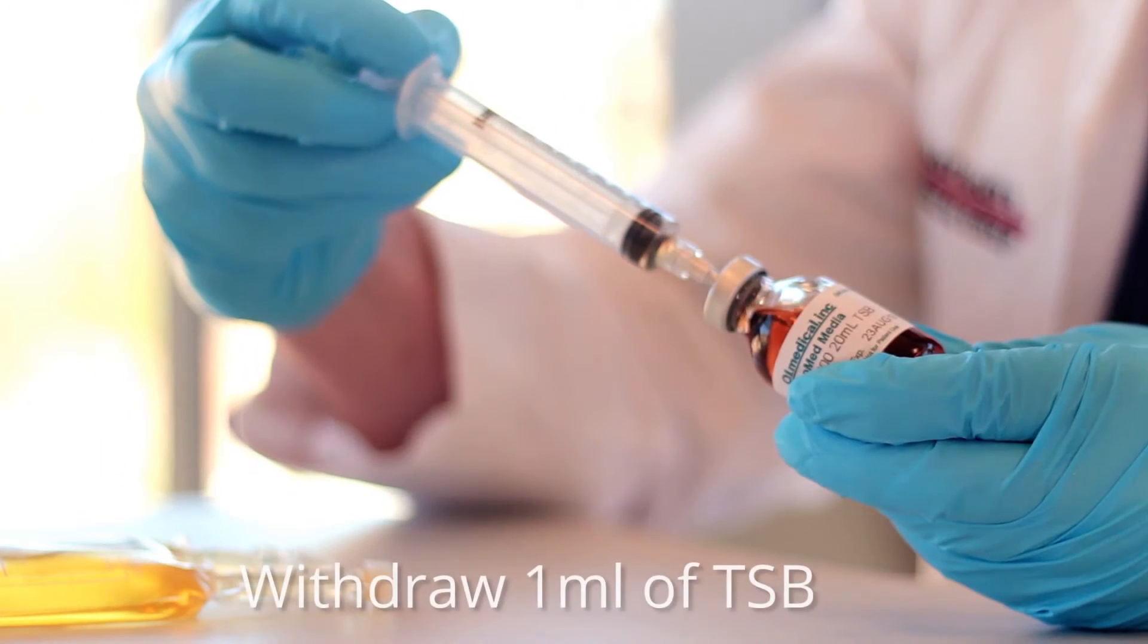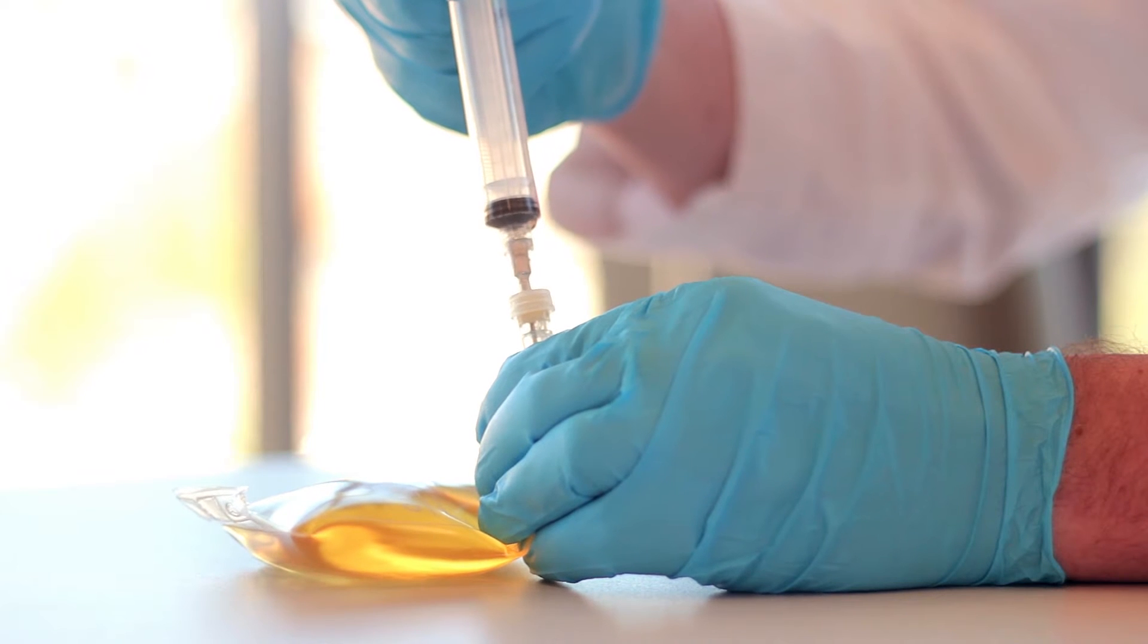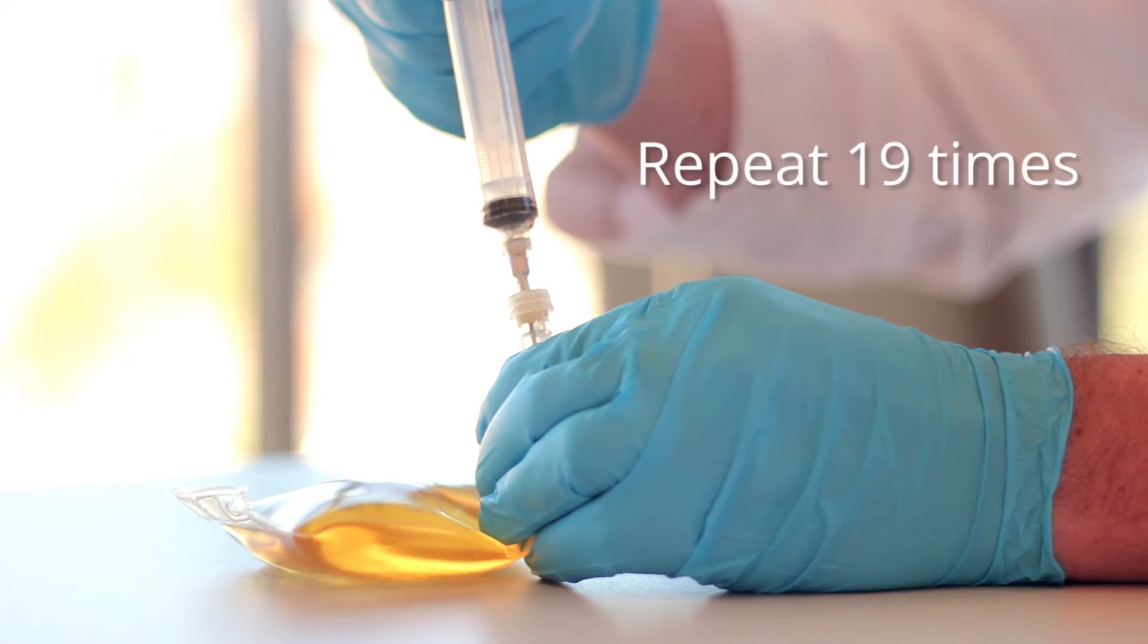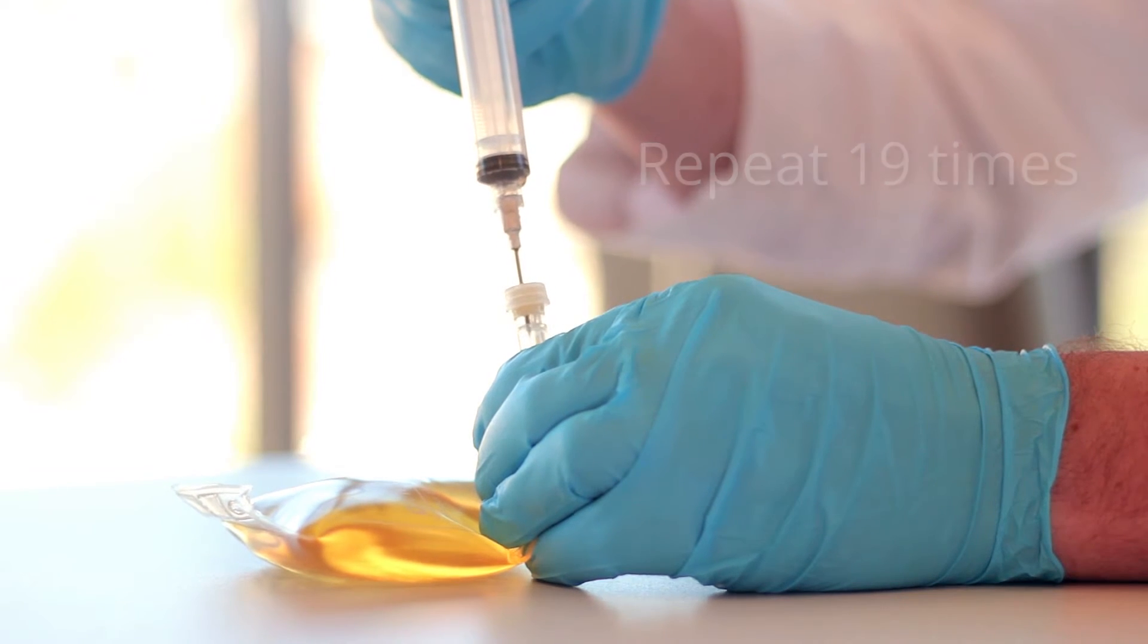Withdraw 1 ml of TSB from the GrowMed vial and inject it into the bag of sterile TSB. Repeat the procedure 19 more times, using 19 different needles but the same syringe and receiving bag of TSB.